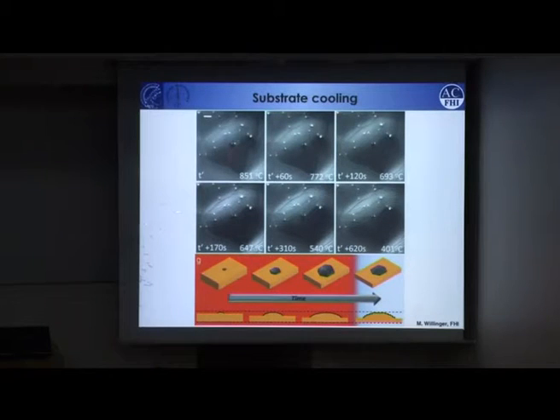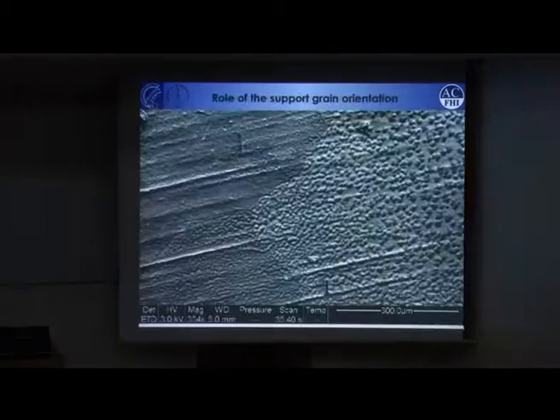We have these hills also. Here it looks like a hill-shaped surface, because at 1000 degrees the copper has a lot of sublimation, so we lose a lot of copper. Actually we coat our microscope and the inside we see with copper. That's why we cover everything with aluminum coating. And so when the surface is going down due to sublimation, at places where you have the graphene, it stops the sublimation, and then in the surrounding the surface goes downwards, and the region covered with graphene grows into such a hill-like shape. So we have lots of such hills, and during cooling we form these steps.